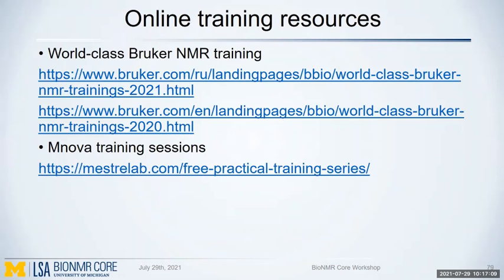And I also want to let you know that there are some online training resources available that give very practical NMR training. One is from Bruker; since 2020 and 2021, they gave a lot of training on NMR. You can actually go to those links, and those videos are still available, so you can watch them when you have time. And also, MNOVA provides some free training sessions that are available on their website, and I've listed the link here. Okay, so we are done with the experiment introduction.